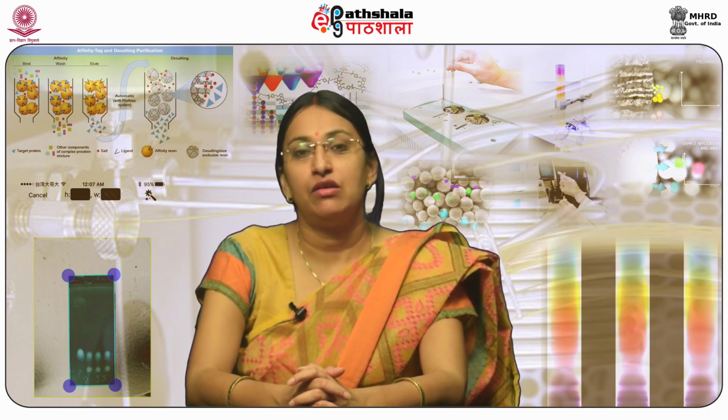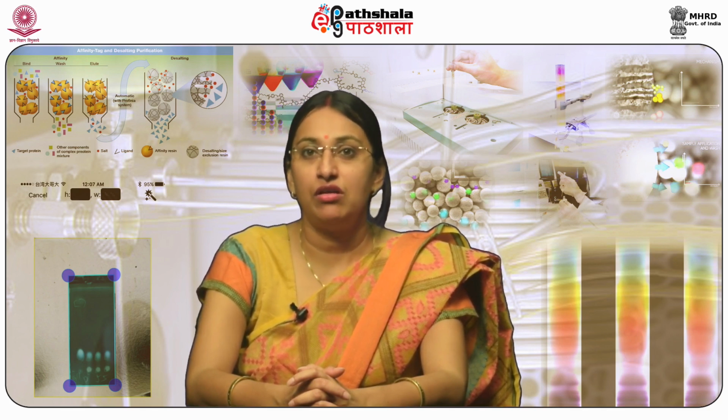Commonly used HPLC mobile phases are water, aqueous buffers, organic solvents, or mixtures of organic solvents. While running the chromatography in an isocratic mode, the composition of the mobile phase is kept uniform throughout the analytical run, whereas while doing gradient elution, the mobile phase composition can be changed to obtain a pH gradient or a polarity gradient.